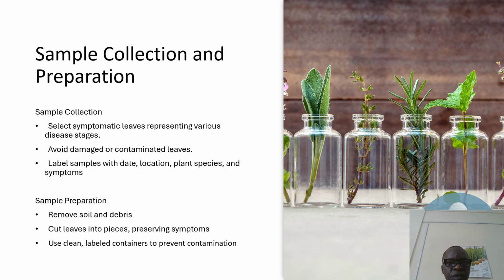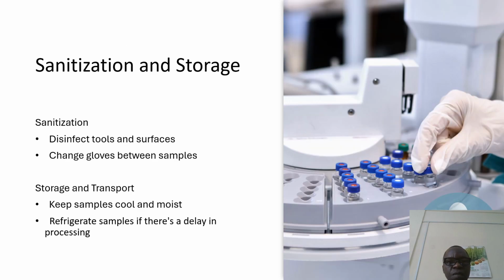And you also need to remove soil and plant debris and cut them into manageable pieces while preserving the portions that are exhibiting symptoms. Of course, you need to also clean and label the containers containing the samples.